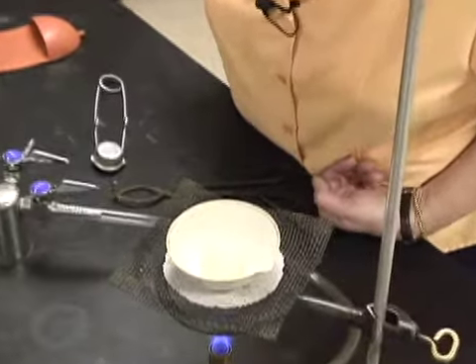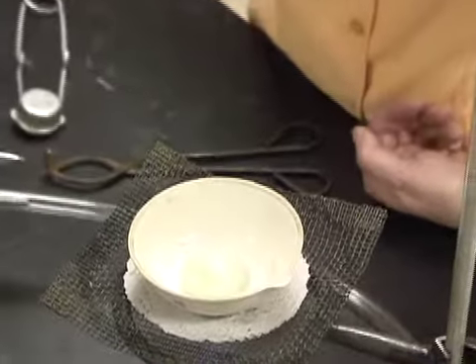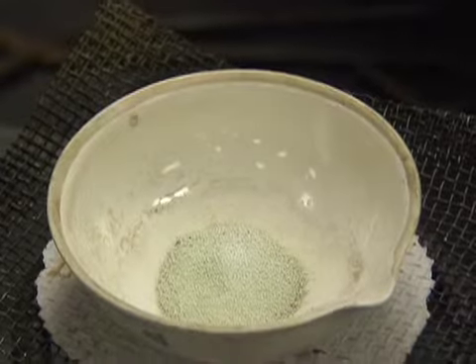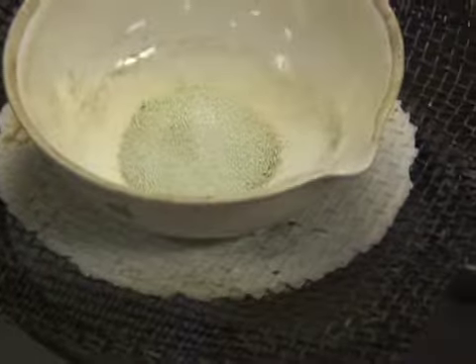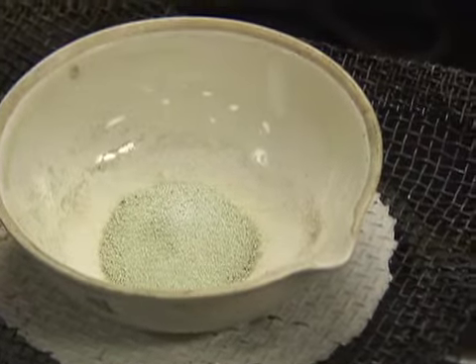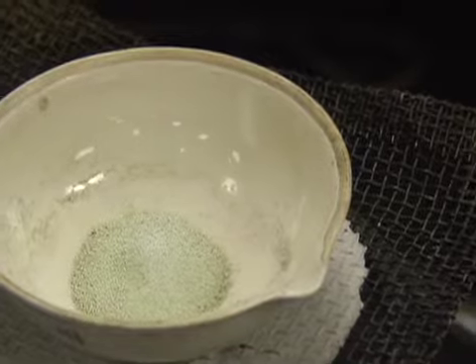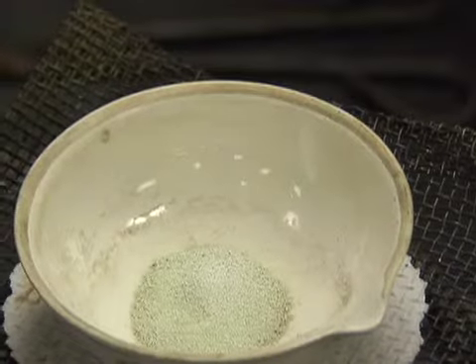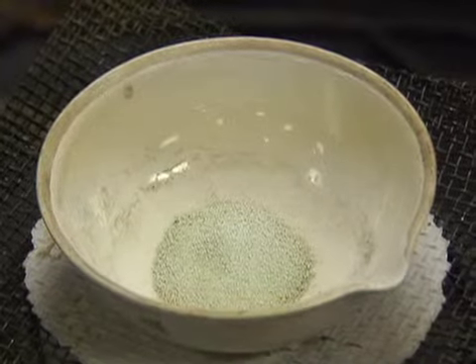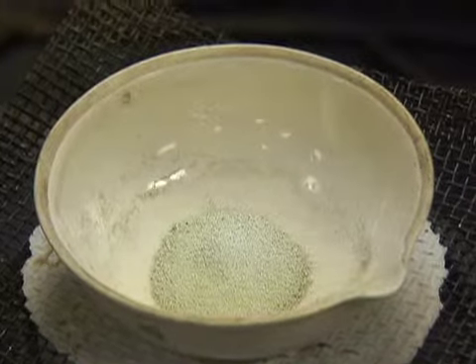And remember, even though it seems like most of the water is gone, that doesn't mean it's all gone, because sometimes I just can't see those water molecules. They don't just pop up and say, hey, I'm still here. That would be nice if they did, wouldn't it? But they don't do that. No siree, they don't do that. But we're getting close to the time. I can see that that light green is showing me that a lot of that water has gone.